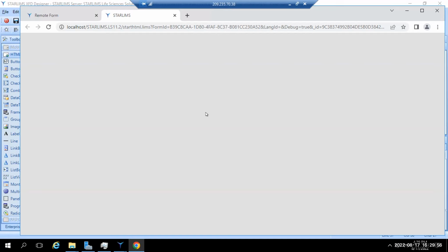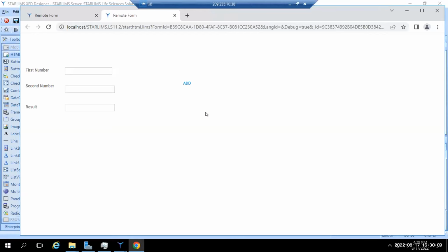So we have a lot of issues, right, with what we just wrote, but it's a good first attempt at a program. And if you start testing it, you're gonna run into a ton of issues. All right, Violeta, so hit add without anything. Let's see what happens. Okay, nothing, but it doesn't crash, so that's good. Start putting in some values here, 1 and 2 maybe, and then 2 over here. Yep, and then hit add.